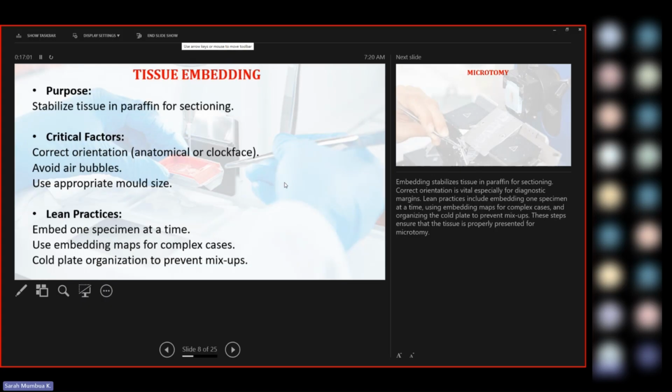If you've seen it before, there's even a small picture, the pink one, where the pink tissue cassette is placed on the tissue mold. So just fill the tissue mold with the wax, pick the tissue from the tissue cassette with the forceps. Now these forceps, everything here, is put on the warm or the hot plate. So pick the tissue, place the tissue onto the molten wax in the tissue mold, then place the cassette bottom down, then top up the wax until it is full.